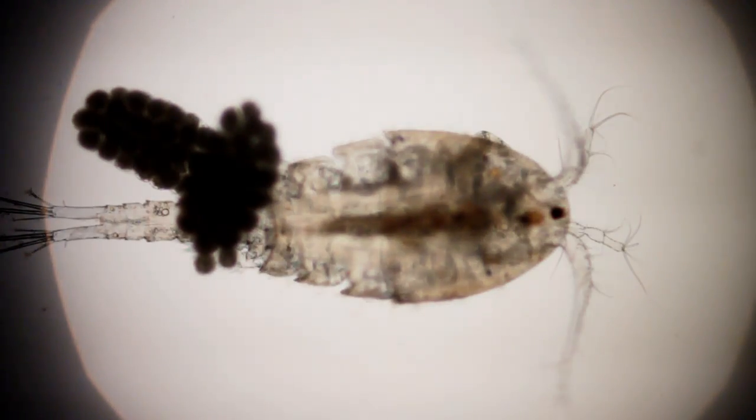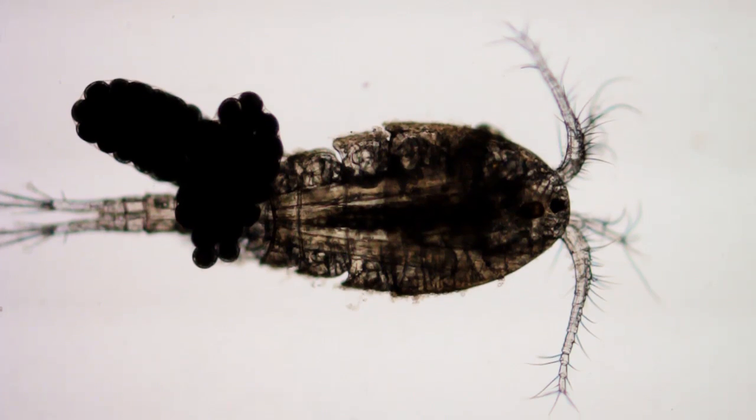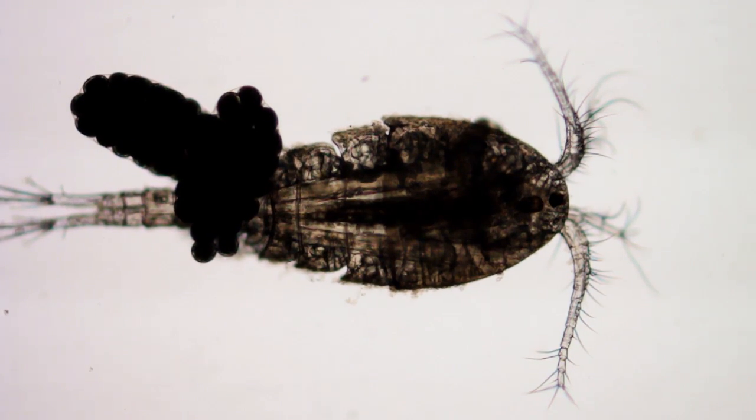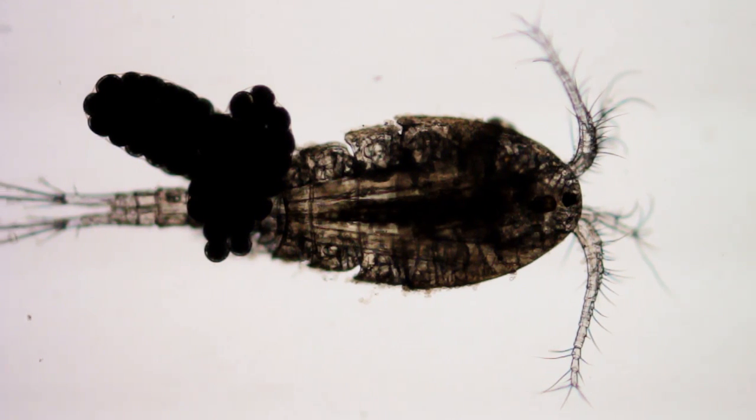I'm going to put her back in the water before she gets distressed. Let's take one quick shot at 4 here. And let's drop down to 2 power just for the heck of it.